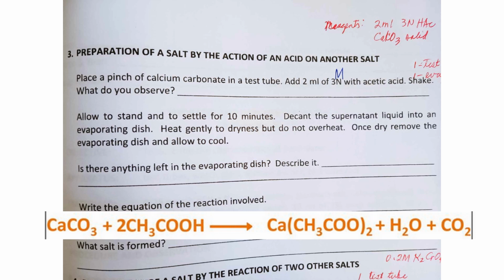Okay, so this is preparation of salt. This is another way where you produce a salt by the action of an acid on another salt. A piece of calcium carbonate in a test tube is added with acetic acid. What did we observe? Production of bubbles. Those bubbles are carbon dioxide.